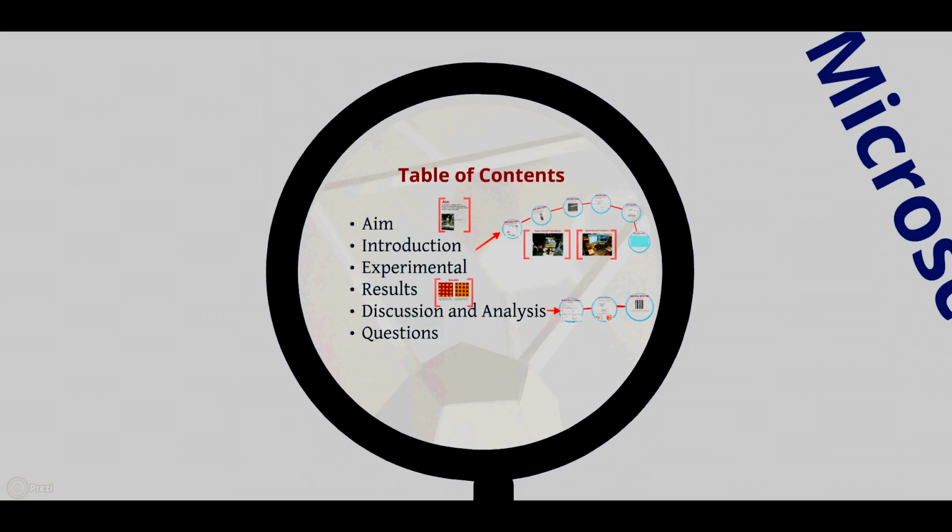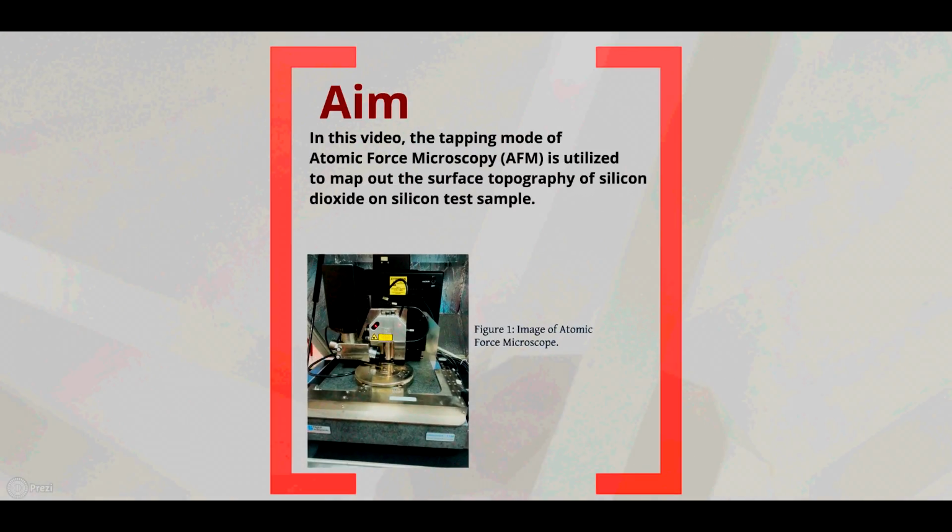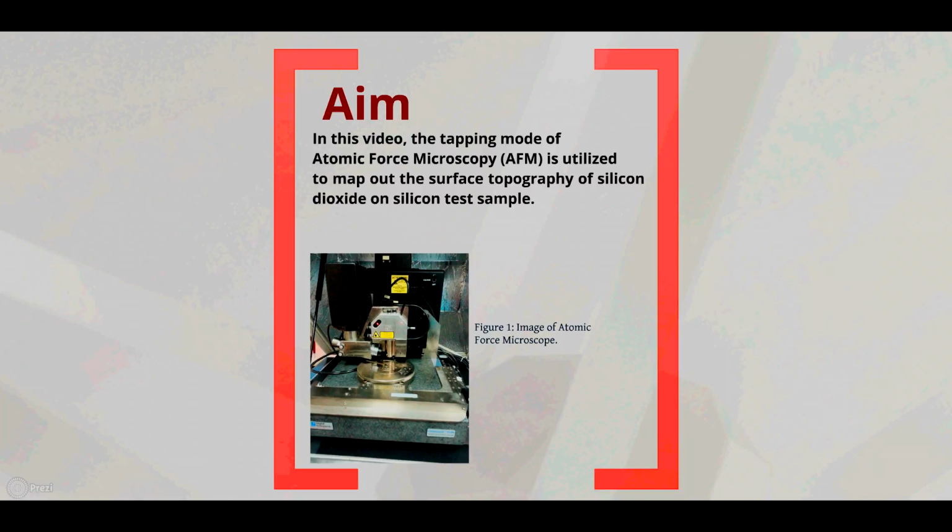This is the table of contents. It shows the flow of this video presentation. Firstly, I will start off with the aim of this tutorial. Basically, using the tapping mode of AFM, I will demonstrate how to obtain AFM images. Right now, let us proceed to the working principles of an AFM.